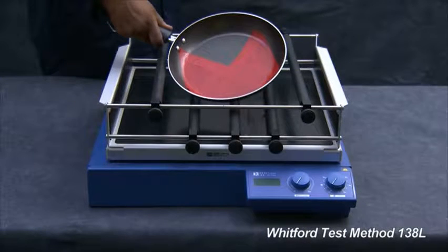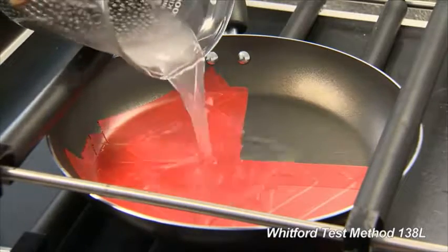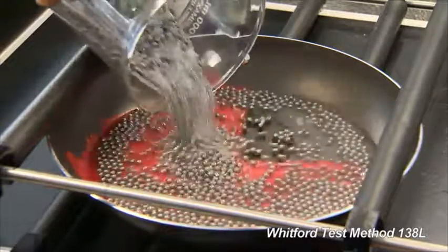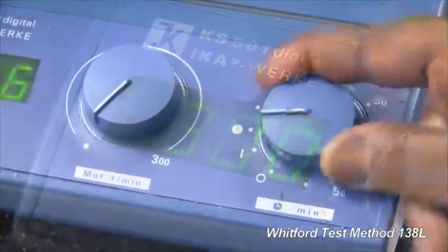Cover three quarters of a fry pan's surface with tape, leaving one quarter exposed. With the pan on the shaking machine, add a mixture of corundum and stainless steel bearings. Set the machine to 300 RPM and the timer to 15 minutes.